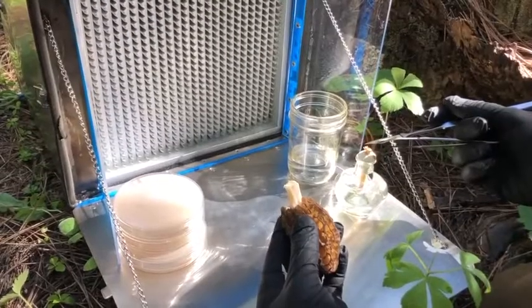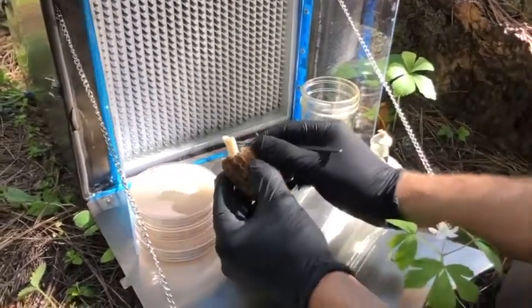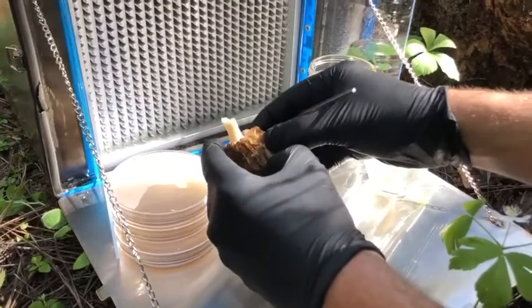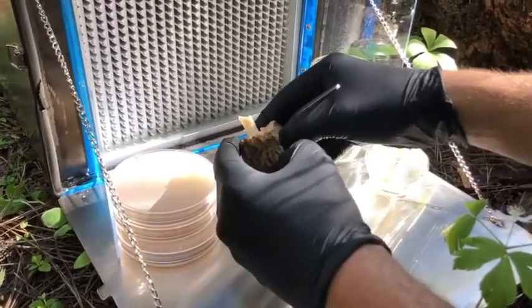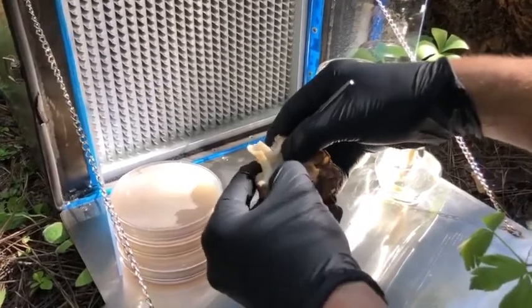My goal is to make this piece of technology accessible to everyone. I want to make it so that anybody on a tight budget can still afford the basic resources necessary to perform all kinds of really important citizen science.